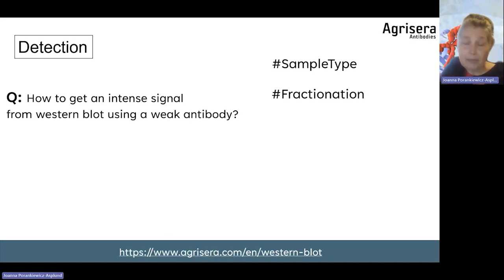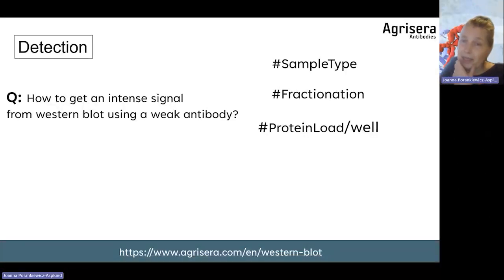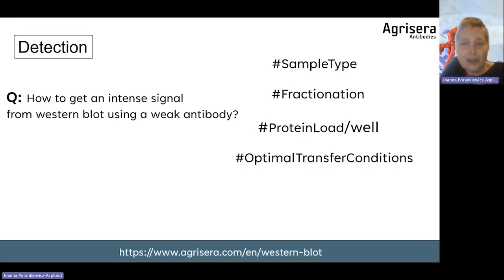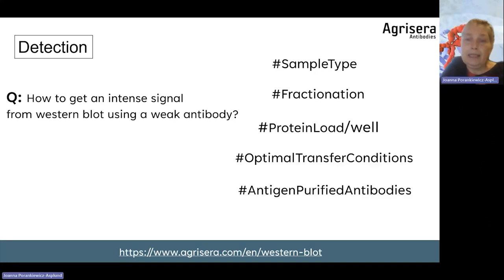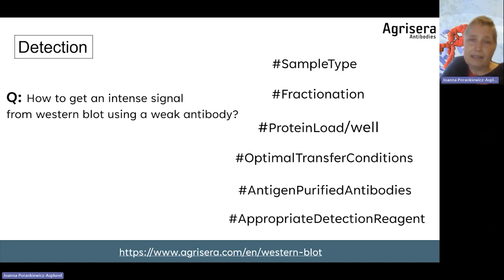Did you use the correct sample type? Was it fresh for low expressed proteins? If it is a low expressed protein, did you use fractionation? Maybe you had too little protein loaded per well. Were optimal transfer conditions applied, or can something be improved there? Did you use antigen-purified antibodies or did you use serum? Did you use an appropriate detection reagent with enough sensitivity?